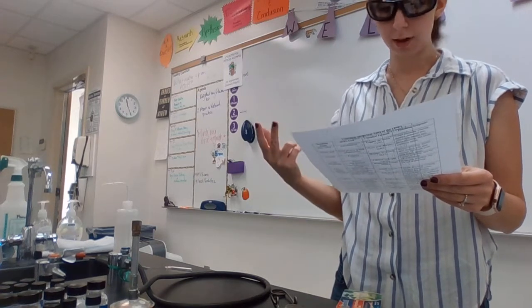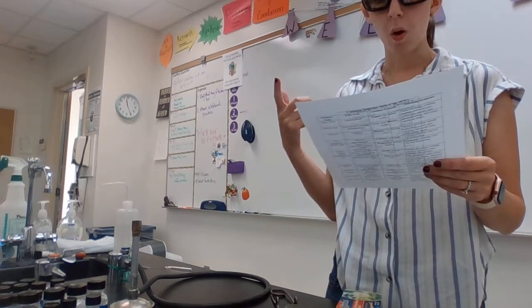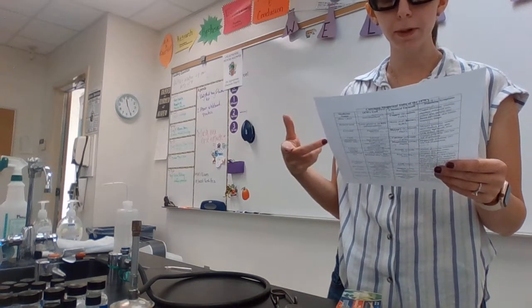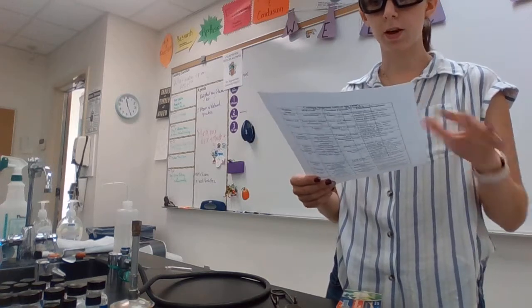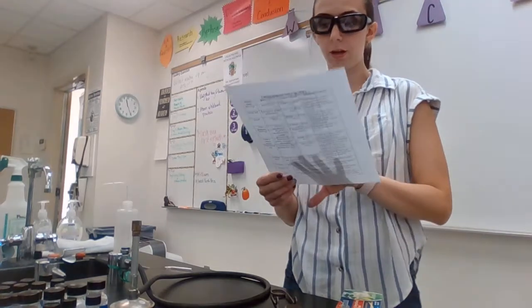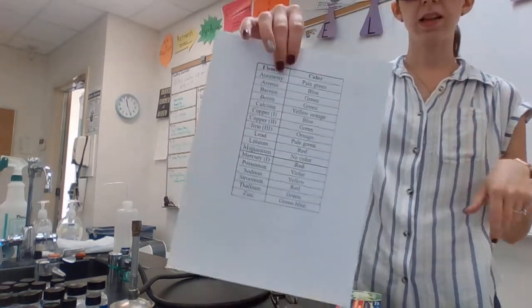So red can be lithium and strontium. Green can be thallium or copper. Boron or barium are some different colors. Orange can be iron. There's some different colors on here. Orange yellow can be like a sodium that's present.